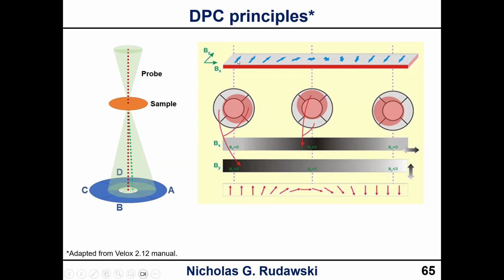If my direction of travel of the electrons is down, so V is down, but I have to multiply it by Q, which is negative. So QV is going to point up. Then I do QV cross B, and that's going to give me a force that's pointing to the left. So what we should see is a deflection of the beam to the left.